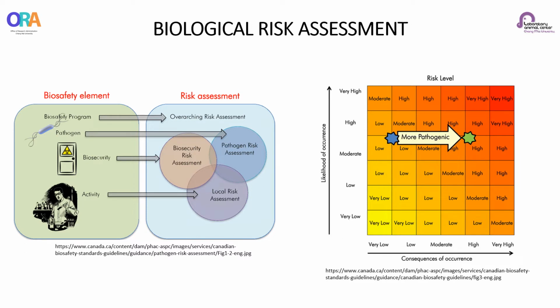Working through the risk assessment process, you identify best practices for manipulating biological agents, how to integrate multiple containment or protection strategies, and how to respond if something does not go as planned. Risk assessment requires careful judgment and is an important responsibility for directors and principal investigators of microbiological and biomedical laboratories.